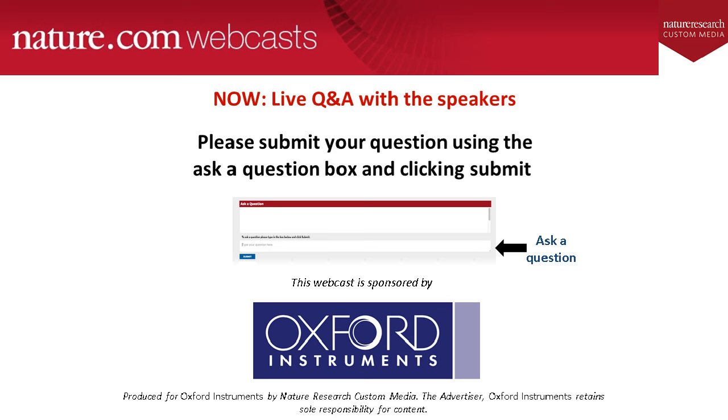In TEM, you've got a very high main beam energy, so you actually activate all of your X-ray lines that may be of interest. And in SEM, because you've got a lower kV setting, it depends what detectors you've got, but for example, if you're using Extreme and biological samples and you wanted to use 5 kV, you may have to look at what elements you're trying to detect, because some of the high energy X-ray lines might not be activated by your beam energy.